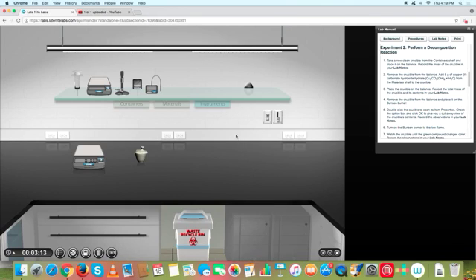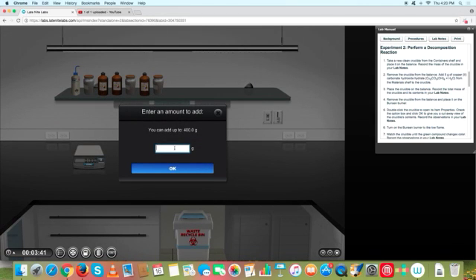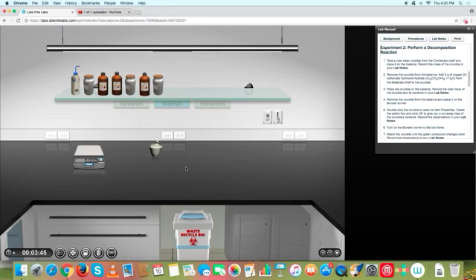And you will have already weighed the crucible in the previous step. And then what you will do is add 5 grams of this copper compound. Let's see if we can find it. There we are, copper 2 carbonate hydroxide hydrate. So that's the stuff that we're going to add here, and we're going to put in, looks like 5 grams. So just stick it over the crucible, type in 5, and you've got 5 grams here.